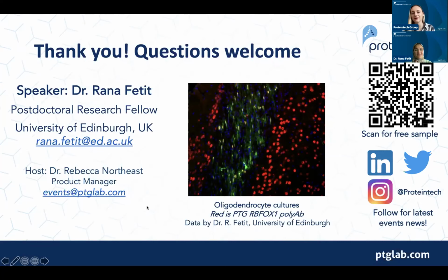Another question about the length of the protocol: it's a very typical challenge that iPSC to oligodendrocyte maturation takes a really long time. How long does it take for you, and are there any ways to shorten the protocol? For us, it takes around 3 months from starting to thaw the cells until you actually get oligodendrocytes, and then you can do follow-up investigations. There are other alternative protocols that we have come across, but you'd need to try it to see if a shorter protocol would give you a higher yield of oligodendrocytes. For us, we've stuck with the longer one because we are confident in the yield that we get from maintaining them for this long and giving them time to mature in vitro.